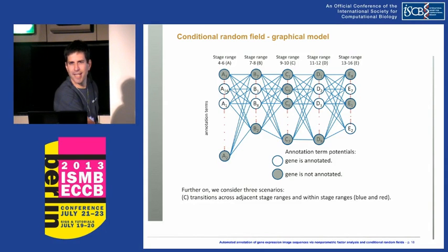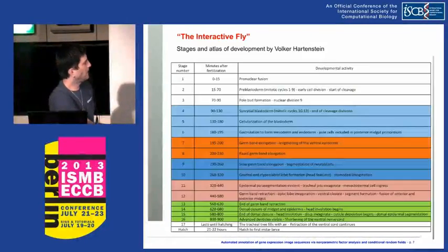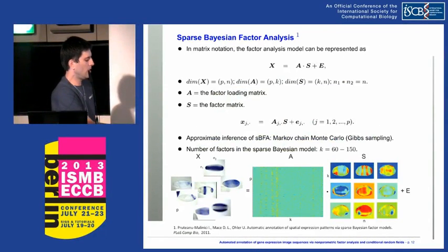Is it right that every feature is a pixel in an image? No, that's a good question. Let me go back, I didn't have time to go through every detail. The original images have a resolution of, let's say, 100 by 200 pixels.